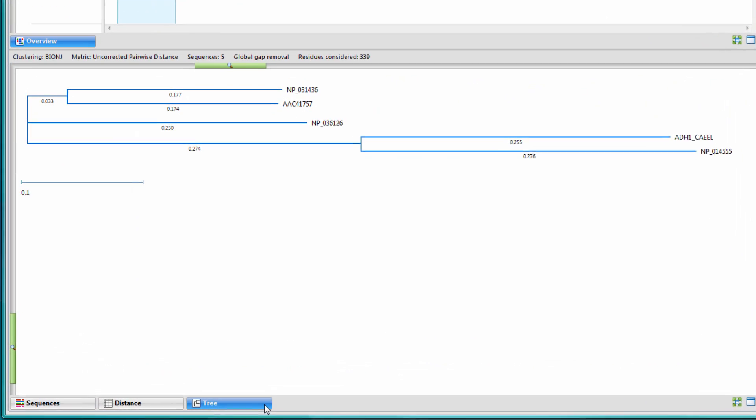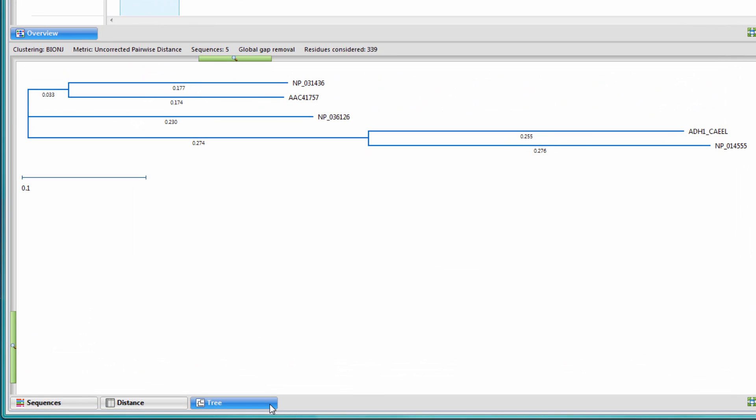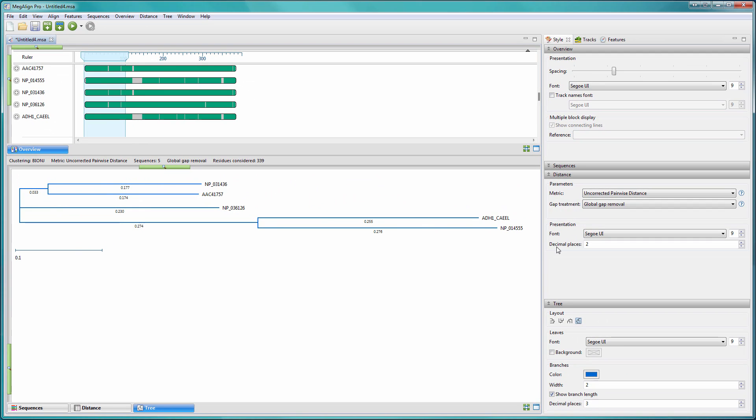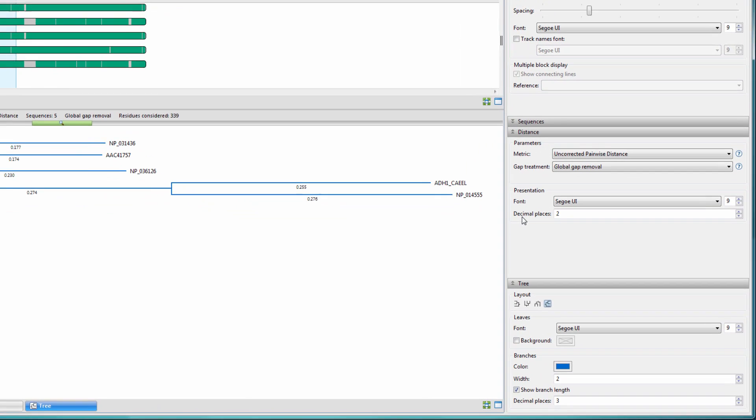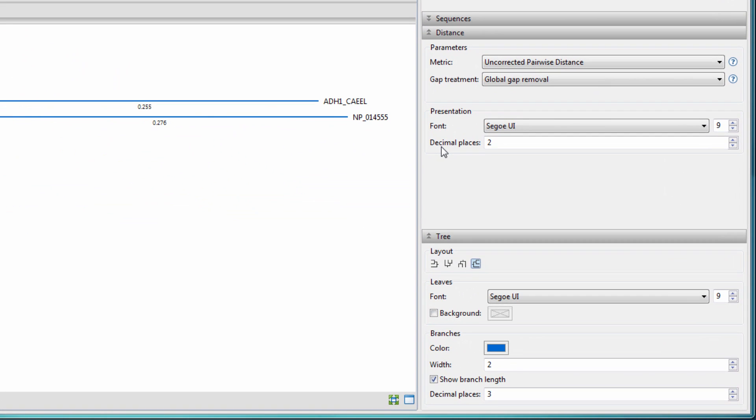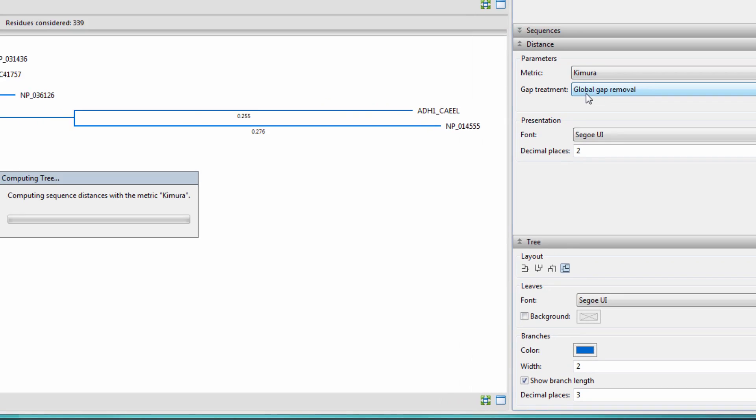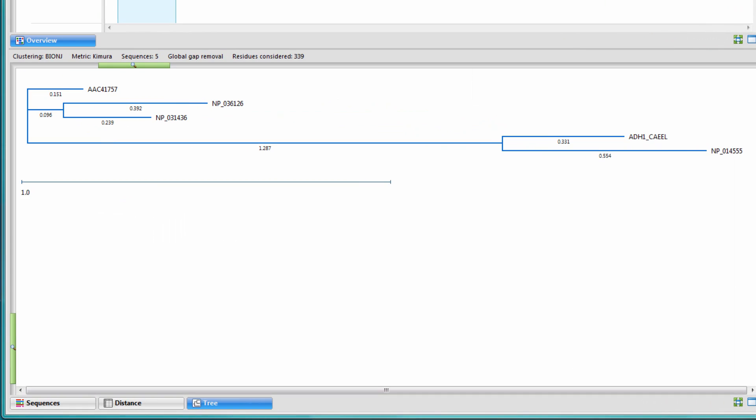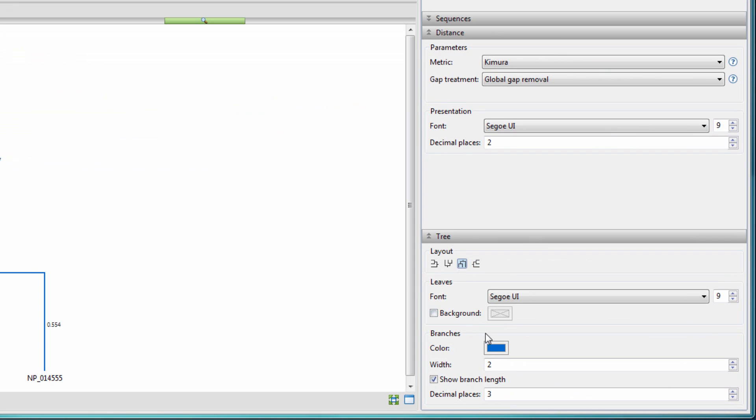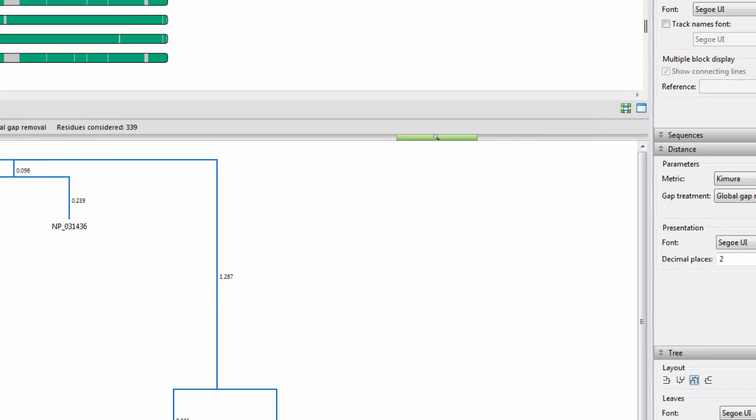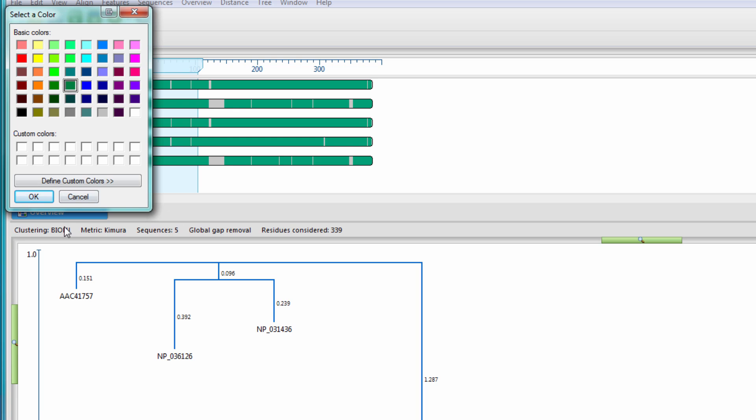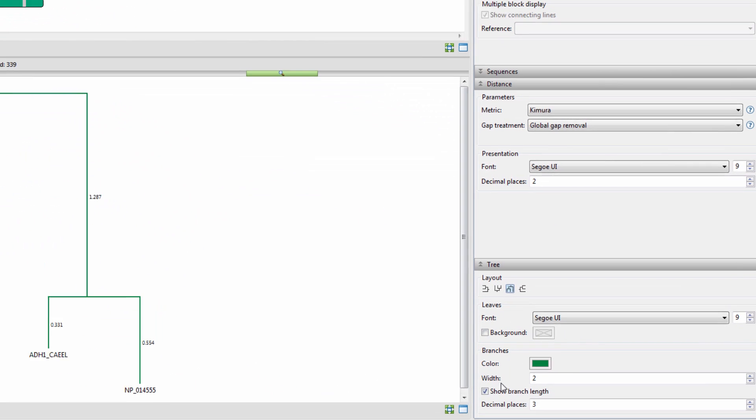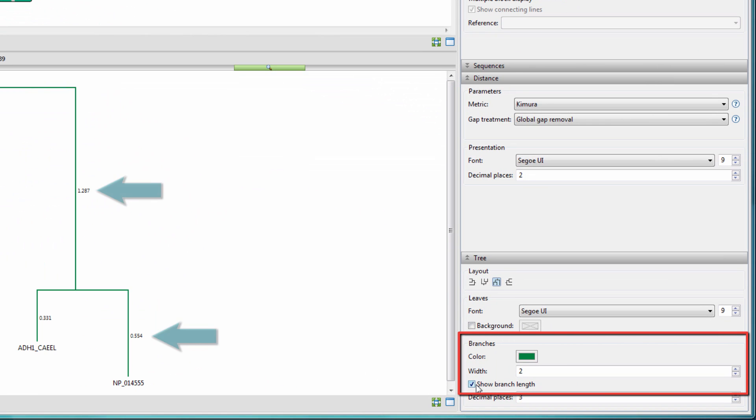open the tree view to see the predicted evolutionary relationships based on the multiple sequence alignment. If needed, you can then use the options in the distance and tree panels to adjust tree settings, including the distance metric and layout options like tree orientation, color, and whether or not branch length is displayed.